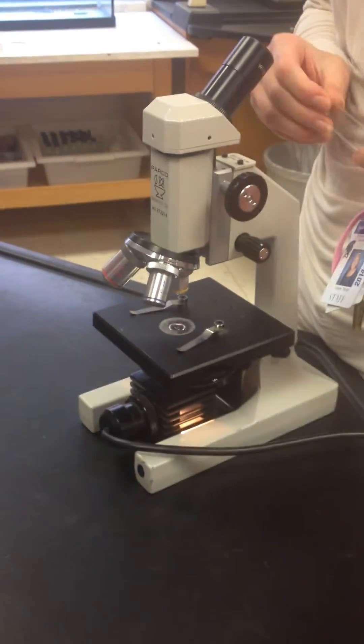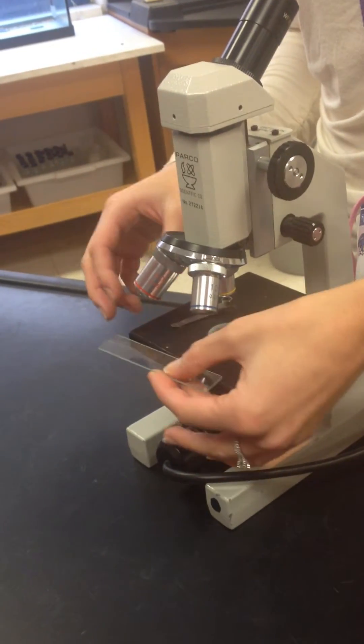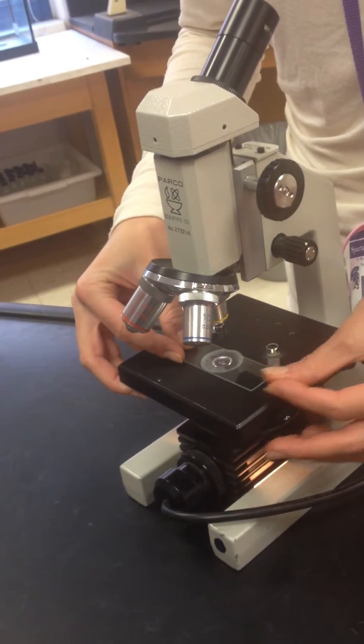So you're going to plug in your microscope, make sure that the light illuminates through the stage, and you're going to take your prepared slide or wet mount slide and place it on the stage and secure it with the stage clips.